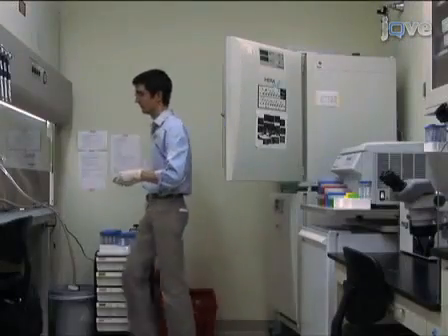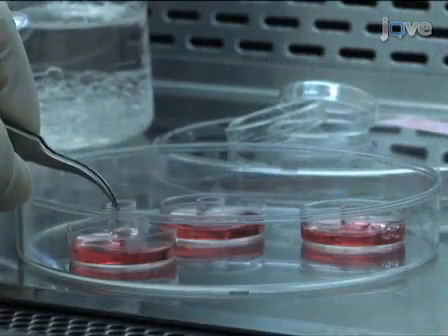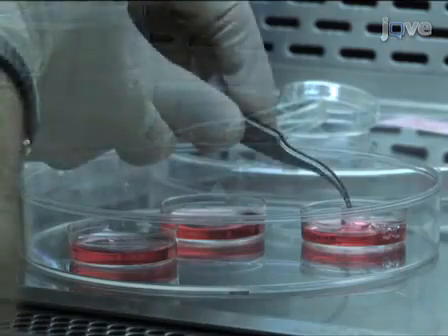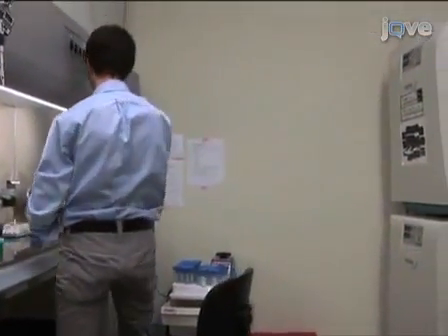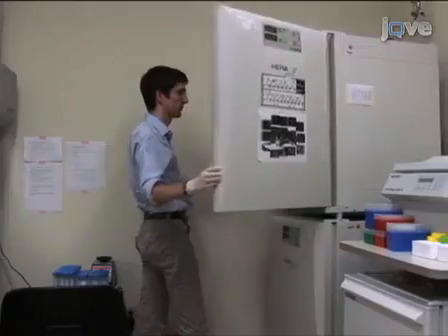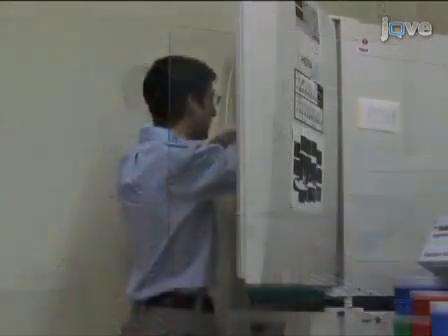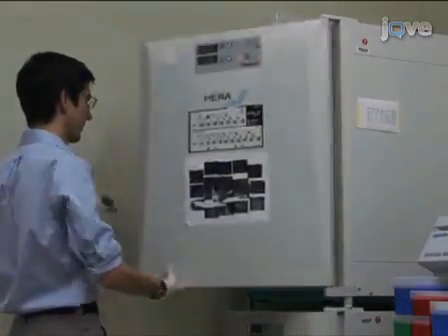One to two hours after plating cells, remove the glass cloning cylinders. Then return the plated cells into the incubator for the remainder of the incubation period prior to the injection session. To start injecting, first take a dish of plated neurons from the incubator and place it on the microscope stage of an injection setup.